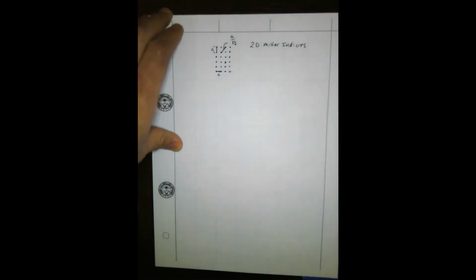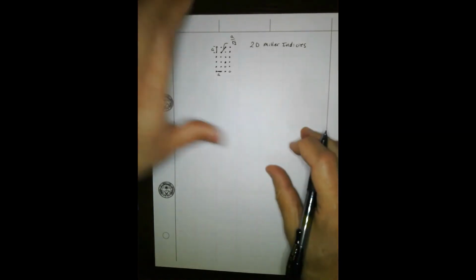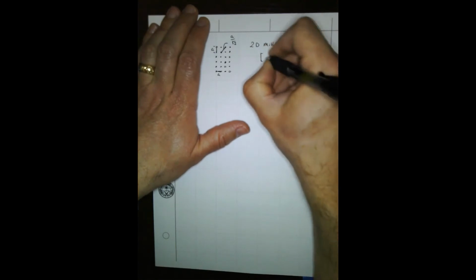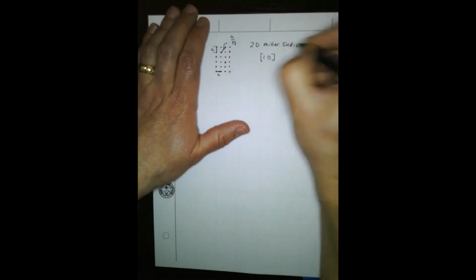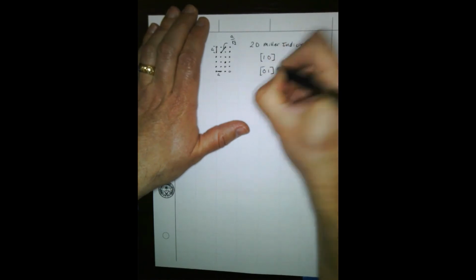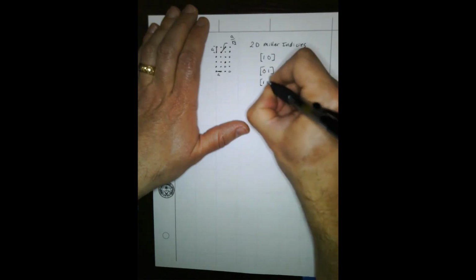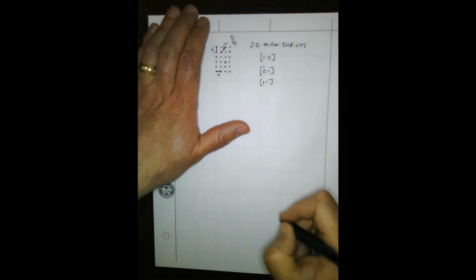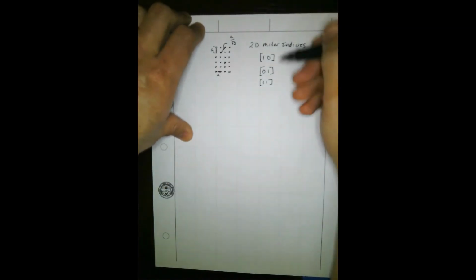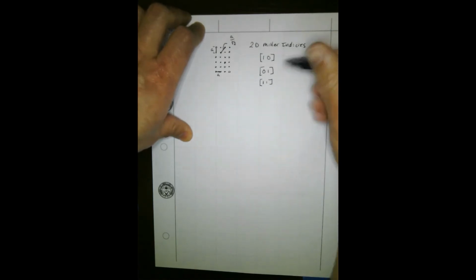And if we look at 2D Miller indices, we're all familiar with Miller indices. We have 1, 1, 1, 1, 0, 0, 1, 1, 0, that kind of thing. We're dealing with 2D Miller indices right now, and it is 1, 0 and 0, 1 that we care about, and then one other, which would be the equivalent of 1, 1, 1 in 3D: 1, 1. It's interesting. We have different k vectors, different diffraction vectors associated with these Miller indices.